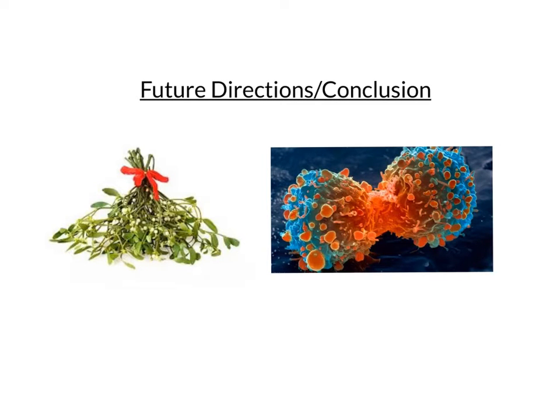With the viability, morphology, and comet assay, it can be concluded that the mistletoe extract is a great inducer of apoptosis in HL60 cells. The viability assay shows the significance in viability between the control well and the treated cells, stating that the extract treatment was effective in inducing apoptosis in the HL60 cells. The morphology assay had to be done at 12 hours because the 24-hour assay had no cells to observe, due to the great effectiveness of the extract killing the cells through apoptosis.